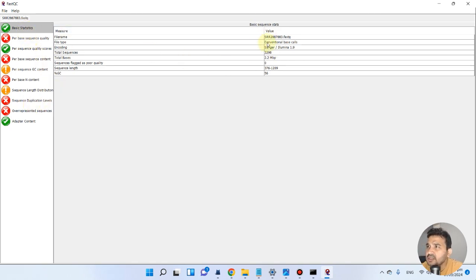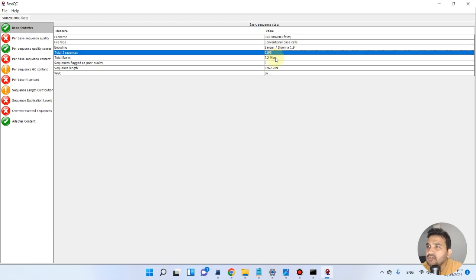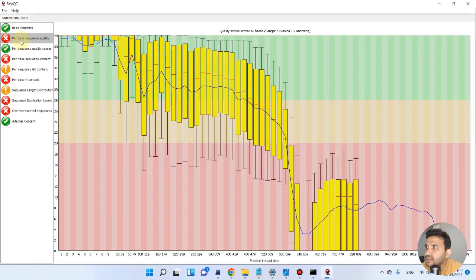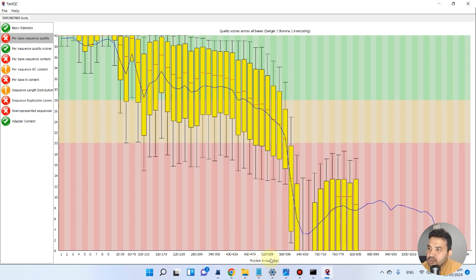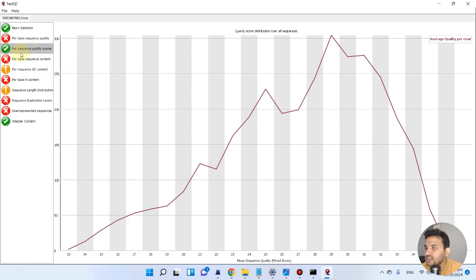Let me show you why it fails. Here in the Basic Statistics we have the file name, the Illumina platform name, total sequences, total bases, sequence length, and percentage GC. When we click on per-base sequence quality, everything should remain in the green region as position in the reads increases. But here, as the position increases, the quality crosses into the orange region and even into the red, meaning the sequence quality is not good. The per-sequence quality score is somewhat okay — it shows a roughly normal bell shape.